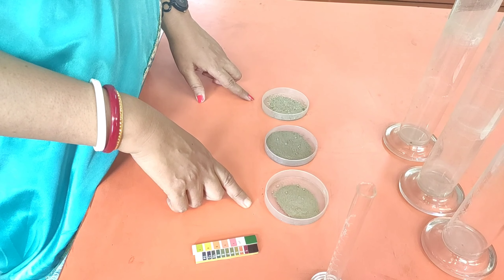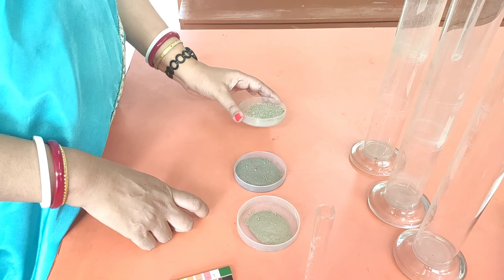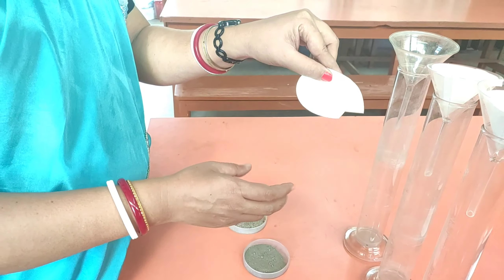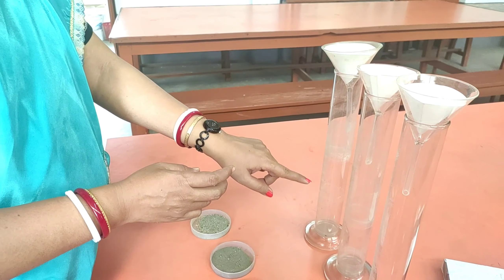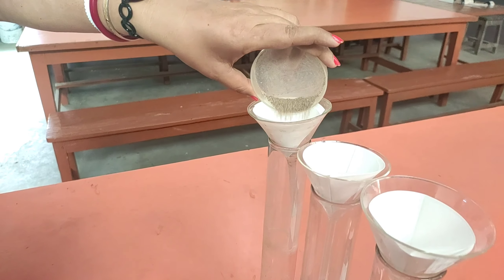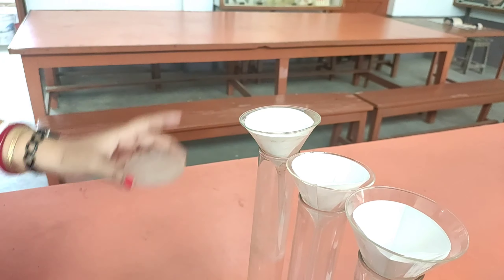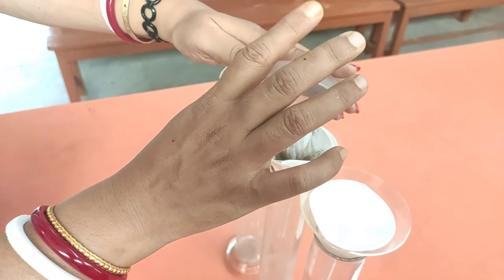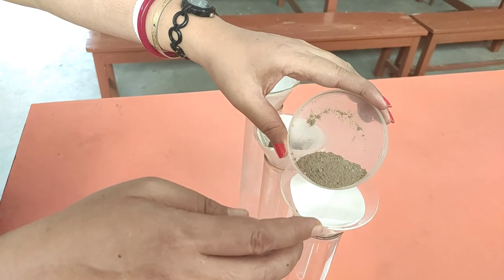What we will be doing now is putting these samples into this funnel, in which I have already made a paper cup using filter paper, and here is a measuring cylinder for all three. I will be pouring sample A into this paper funnel first, here is sample B, and this one is sample C.